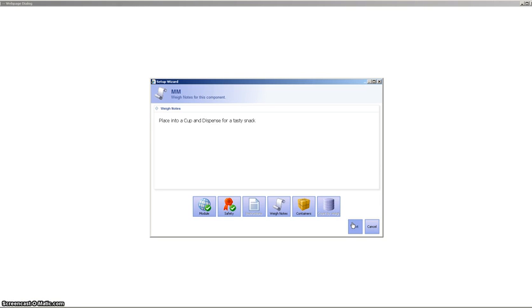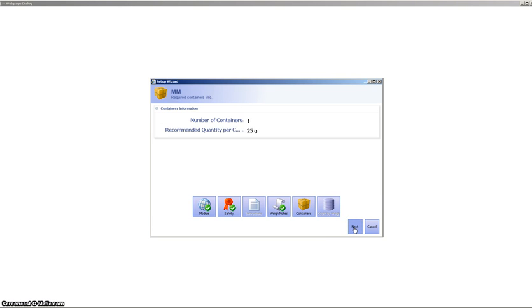We're going to move on. Here's some generic weigh notes. Place the M&Ms into a cup and dispense. Once we've reviewed the weigh notes, we can see that it's recommending that we use a 125-gram plastic container. That's good, and we'll move on.